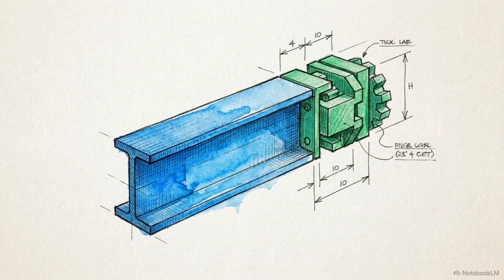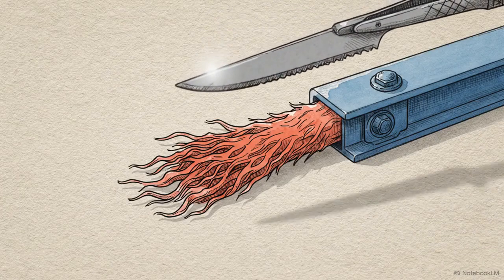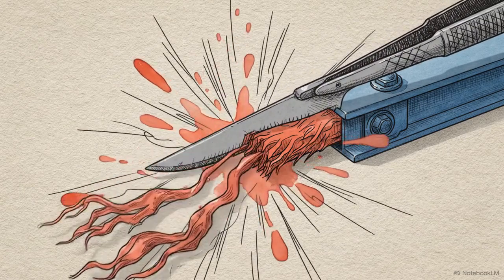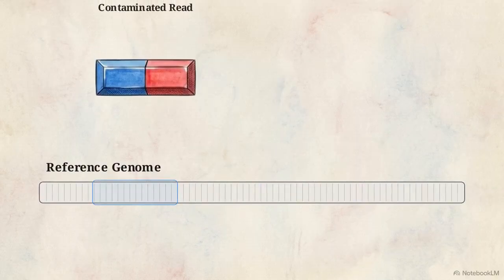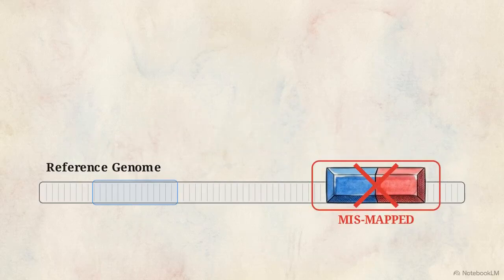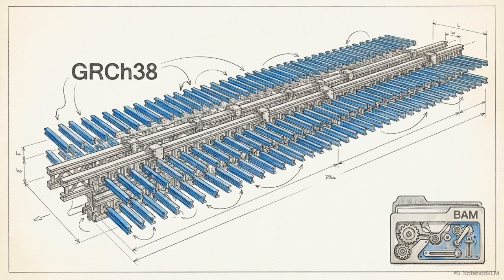High confidence in the base call does not mean the sequence is purely human DNA. During library preparation, artificial sequences called adapters are attached to the ends of the reads, which often degrade into low-quality tails. QC software tools like FastP or Cutadapt perform a process called trimming, slicing away these artificial adapters and degrading tails. If these artificial segments remain attached, the read will map to incorrect locations on the human genome during the next step. Base-level quality is the foundation. If corrupted or artificial data survives the FASTQ file, false mutations will inevitably exit the clinical report.